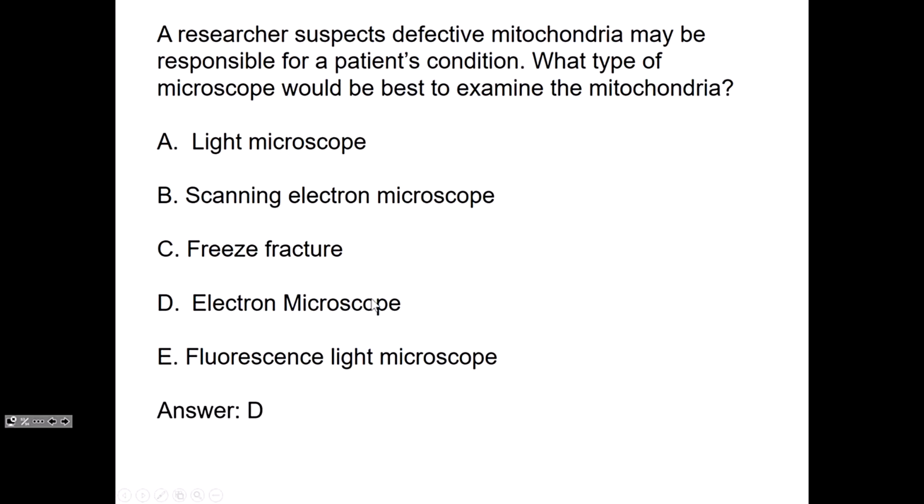You've got to be able to melt and make a mist of some sort of metal or carbon that's going to coat evenly over your structure. Some compounds, probably, if you zap them, they would break up, right? You couldn't use organic compounds because they would just break up into different pieces. It would become denatured. But gold is a very uniform single element, so it's not going to break up, and it can be misted, so it can then cover the structure.